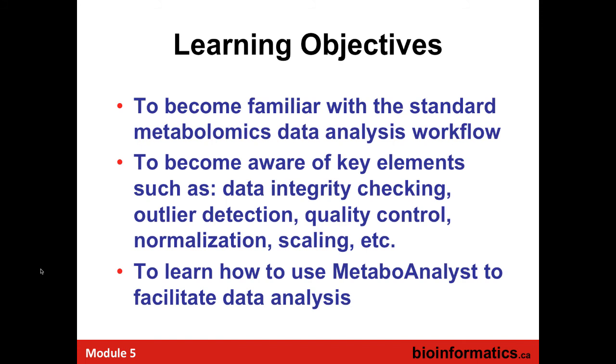Now, in addition to this introduction to MetaboAnalyst, I think we sent out a chapter from Current Protocols in Bioinformatics which describes MetaboAnalyst. Did anyone see that or download that? Or I don't know if we got that text. Anyways, it goes through MetaboAnalyst screenshot by screenshot and page by page, and I think we were going to make that available for the pre-reading, but we'll try and maybe make that available for you for the lab as soon as possible.